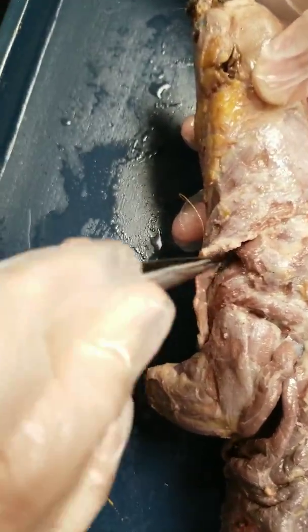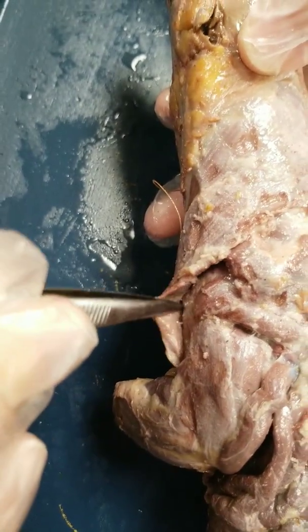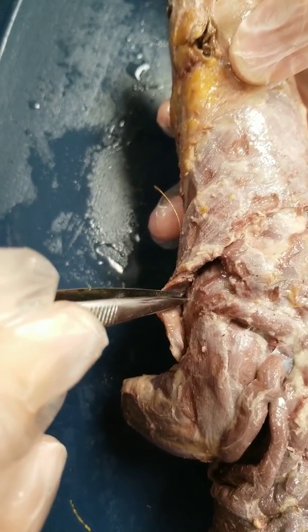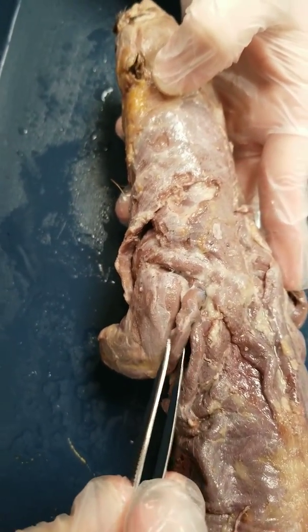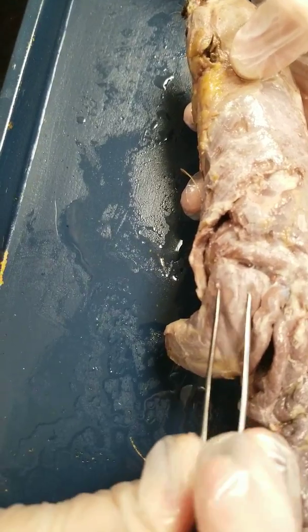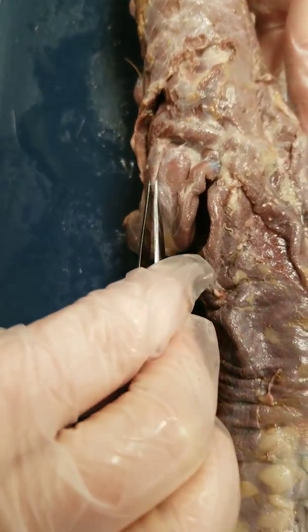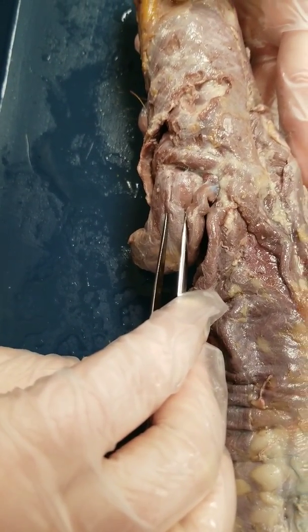Just leave the bicep brachii there — it doesn't need to be pulled up or lifted back, just make sure it's visible. This is your tricep brachii muscle. I've got one of the heads divided; you can see another head here. Just trim the fat off and maybe divide the heads a little bit more, but you're not going to lift it back — leave it intact.